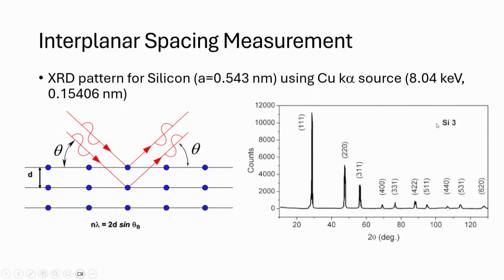Now it's actually silicon, so it's diamond cubic, it's not exactly FCC, so there's a couple of other things. You know, you have a 200 that's missing, but the 400 is there, for example. So it's a little bit different, but you can go in and you can check what these angles are. You can check the relative d-spacings of these, and from that you can back out what exactly planes are diffracting to give what peaks. Right? So we won't go into that part of the analysis.